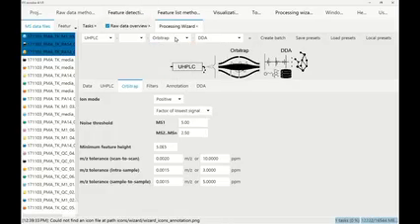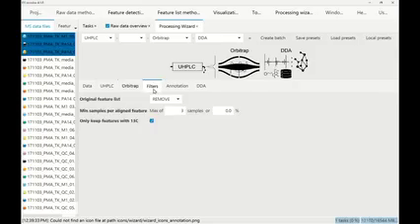If you change to Orbitrap, there's the factor of the lowest mass detection step, and this one is, I would say, quite universal. It really works well for any Orbitrap data set. You can just increase the factor, it's kind of like a noise level, if you have a very large data set. If you have a small data set, you can basically set it to nothing and it's still going to work. And we can increase the minimum feature height to 5E5. That's just for this data set. And that's it, basically. There are some filters which you don't have to set now.